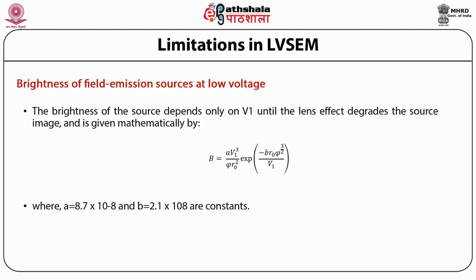Several field emission guns have been designed to incorporate a magnetic lens that operates on the beam leaving the tip. These magnetic lenses possess advanced electron optical characteristics compared to electrostatic lenses and produce improved performance when operating at high current and low beam voltage.